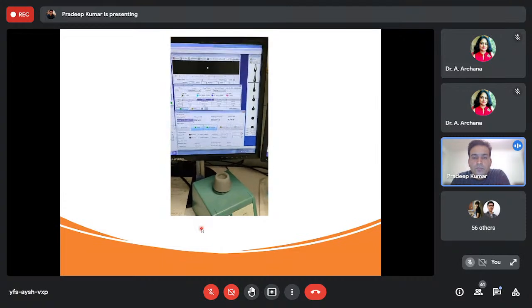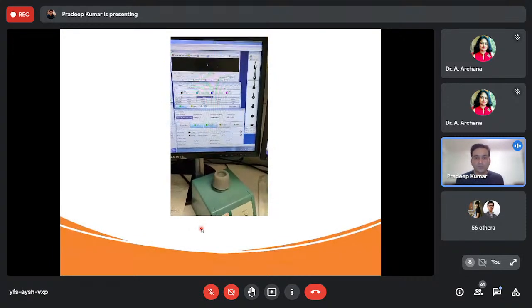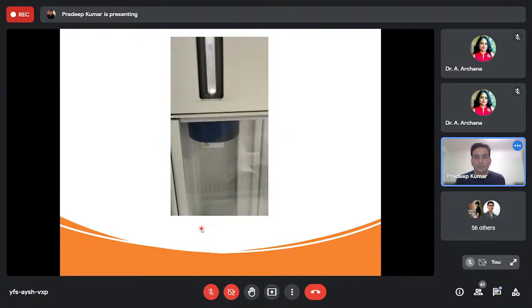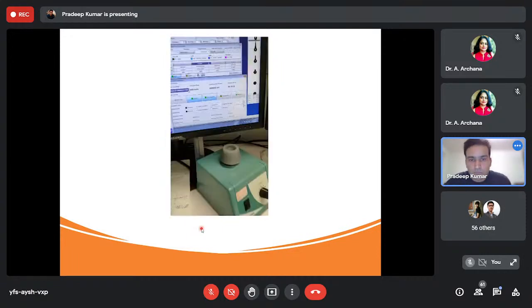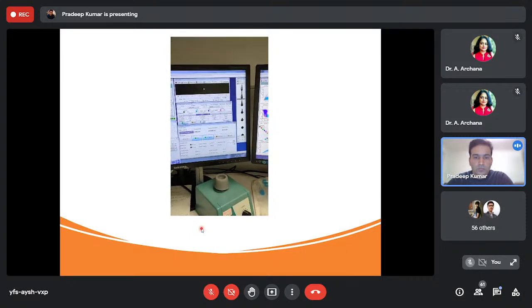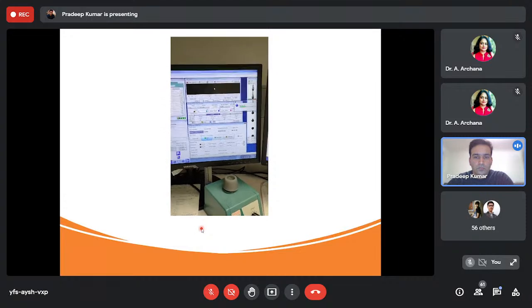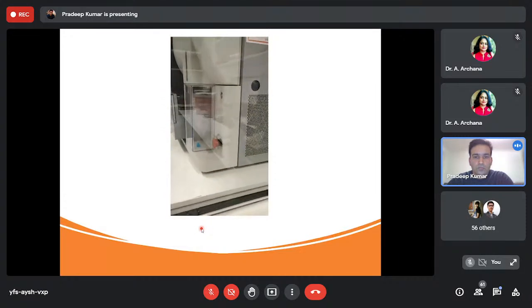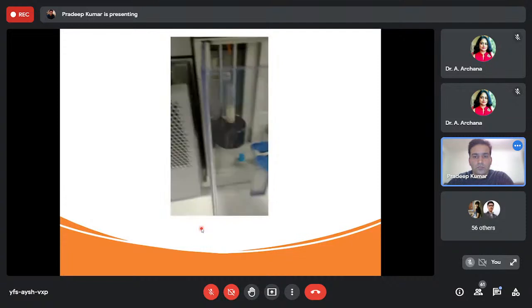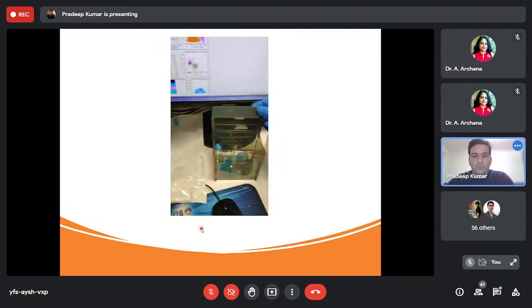The sample that I'm running is about to finish because I can see through here that the tube is about empty. So I'm going to stop the sorting, and the moment I stop sorting, I stop the acquisition. When I click on unlock tube, you'll see the tube will come down and the sample is unloaded. I'm going to take that sample and put it into this tube.